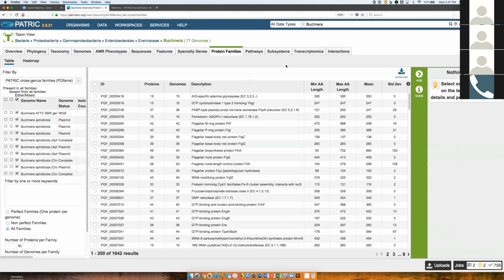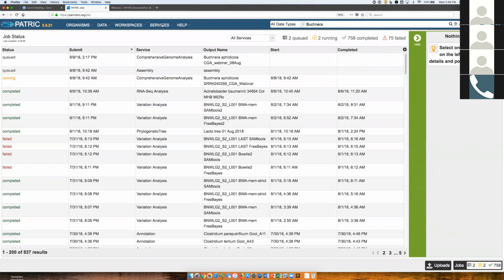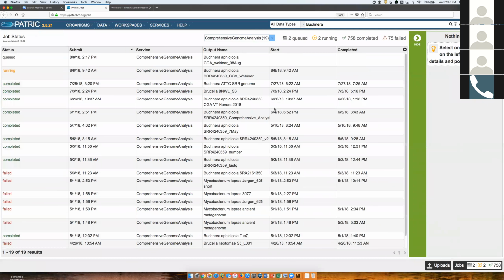Did you want to show that file to the tree? Oh, to get it to load? The one that you, no, not the one you had to show in PATRIC. Which one? Say it again. Sorry. The one you had in PATRIC. Ah, yes. There's a question of looking at one of the phylogenetic trees that was in PATRIC. Yes. So you started that. Yeah, I started that. Let me go back and filter on that.